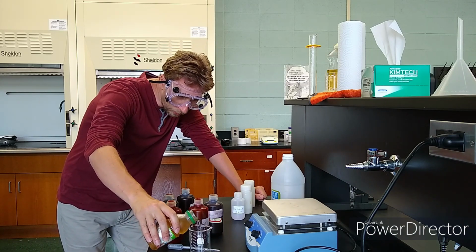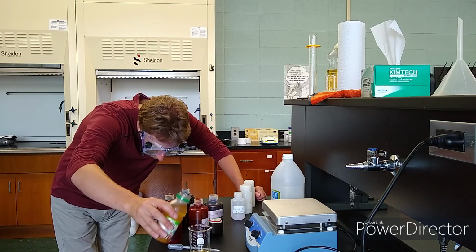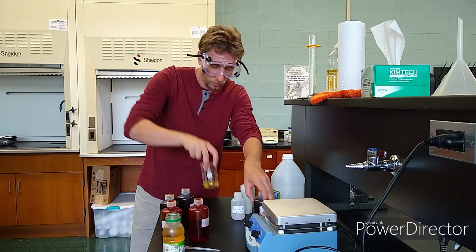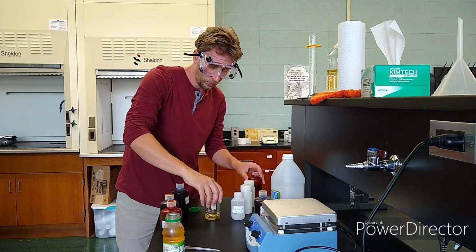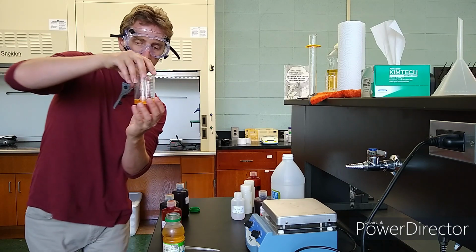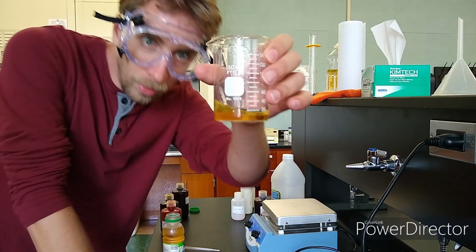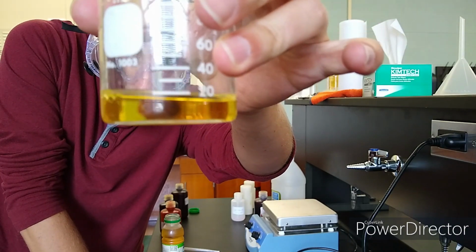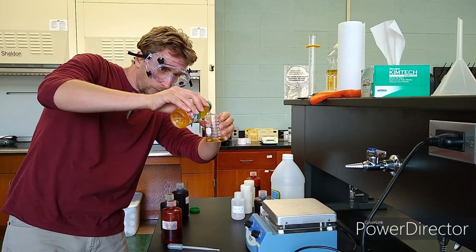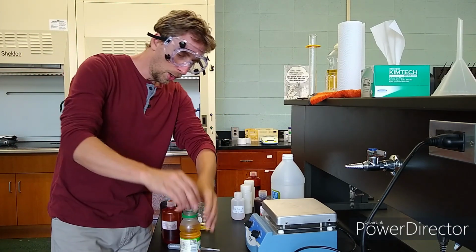So I need about 20 milliliters of the juice, right about there. I don't know if you guys can see that now. Let's put it here. Yeah, 20 milliliters. It doesn't have to be exact. This is just a little check. Okay, so there's 20. Actually, it's probably a little less, so I'm going to put a tiny bit more. Ooh, that's probably too much. Oh well, this is just a check.